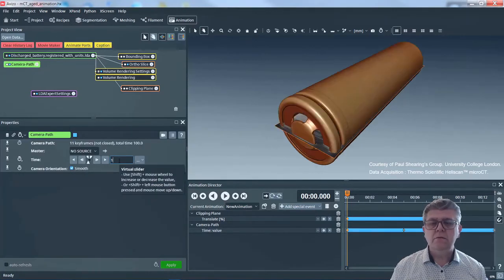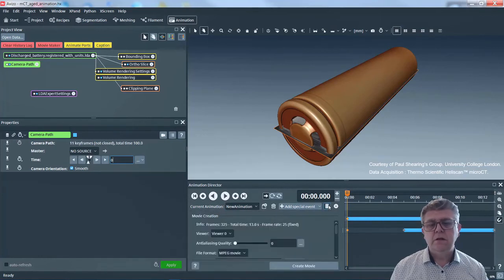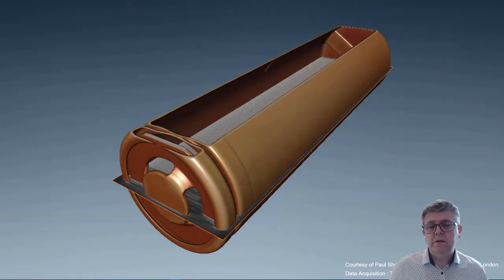And then I can move around my camera, and everything will be steady at this resolution. It's a choice. You may choose other strategies, since you have the LDA expert settings, but this is usually okay. So this is the video result.